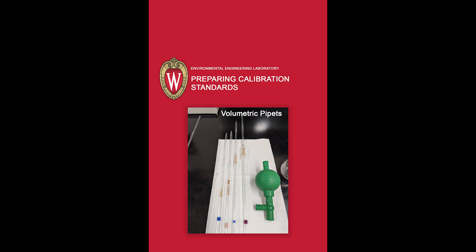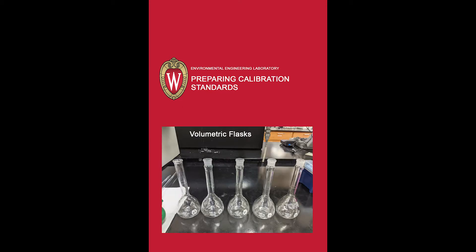You will need volumetric pipettes and a pipette bulb. This is a three-valve style pipette bulb where A is pressed while squeezing the bulb to release air, S is pressed to fill a pipette, and E is pressed to deliver the volume of liquid. Additionally, you will need a set of volumetric flasks.